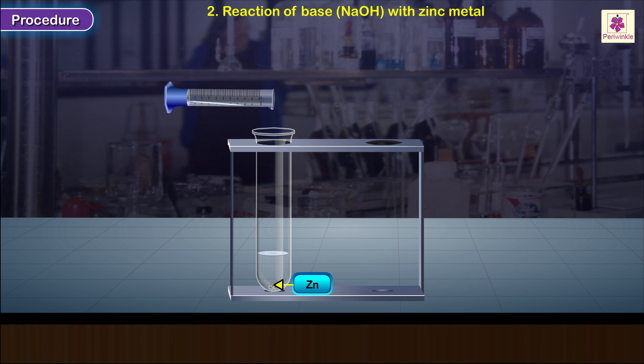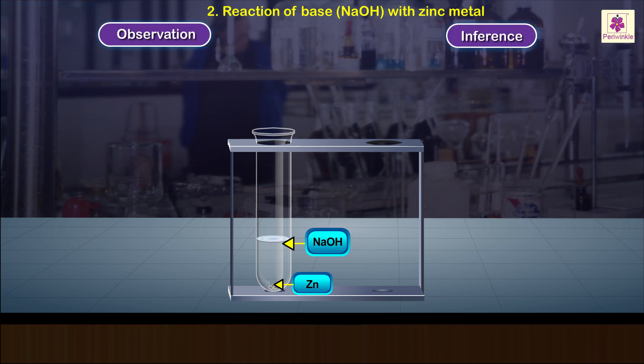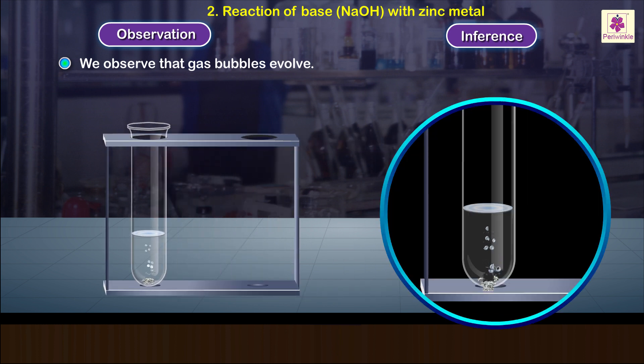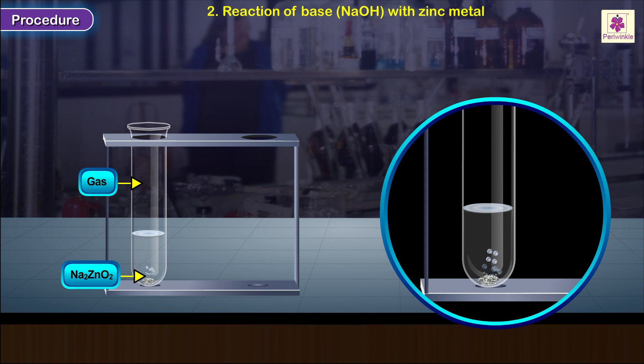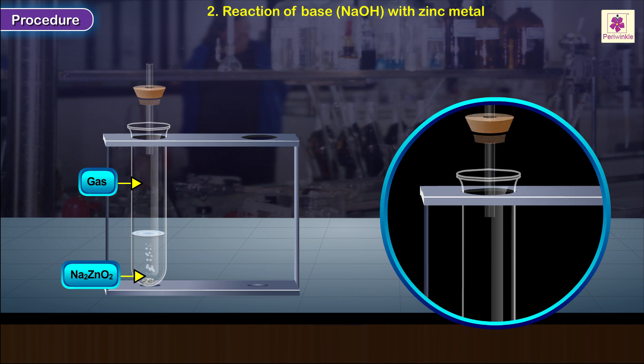Observation and inference: We observe that gas bubbles evolve. This shows that at least one of the products is gaseous. When some bubbles evolved in the solution, close the mouth of the test tube with a rubber stopper inserted with a glass tube having a jet end.